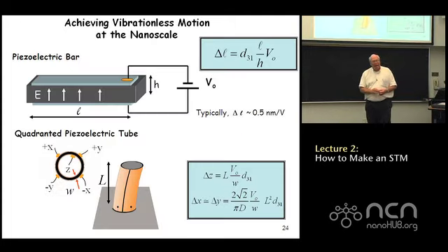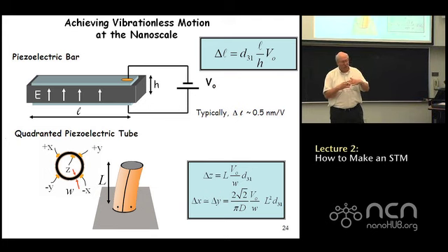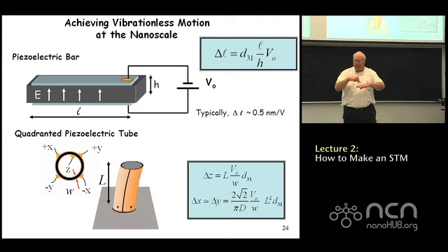There's an issue about how to achieve nanometer scanning and positioning without vibration, right? If the tip is positioned above the substrate with a precision of 1/10 of a nanometer, how do you adjust its position such that the vibrations of adjustment don't completely destroy the measurement? This was a big problem in the early days, right? It wasn't clear how to do it.